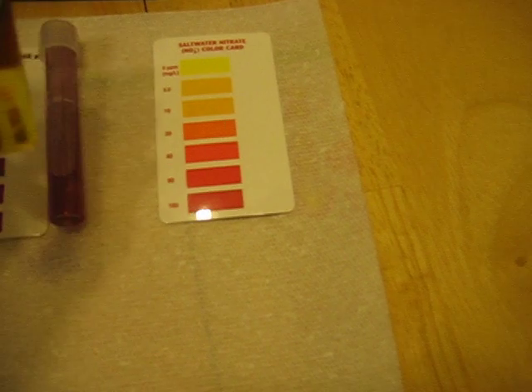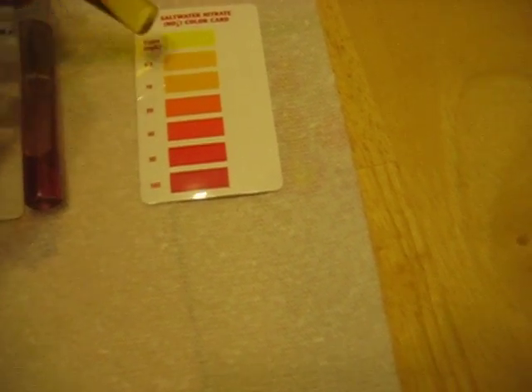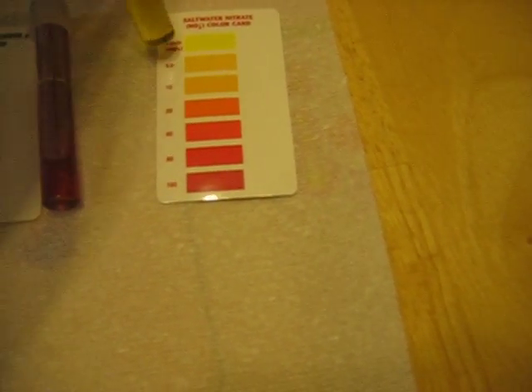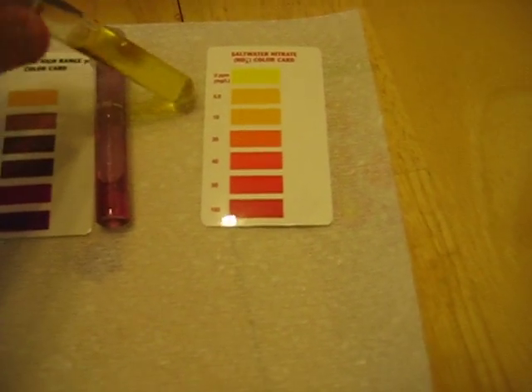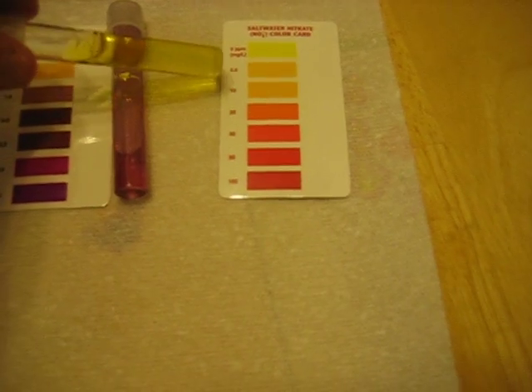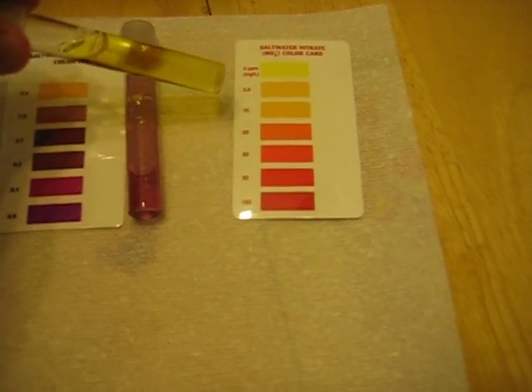We have the nitrate here. It's not quite as bright yellow as zero parts per million, but it's not anywhere close to the five parts per million either. So I'd lean more closer to zero. There's definitely a little bit of nitrate in there, but we're still well within normal limits.